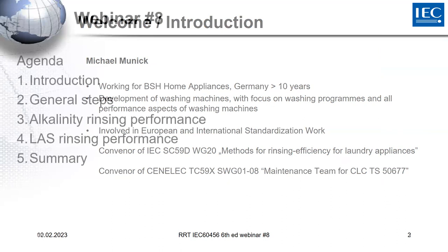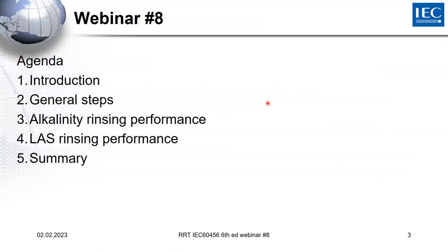So let's go on. Today I have a short agenda, a little bit of introduction. What do we do? What are the general steps that we have to perform besides everything else? I will not go into the details of the normal performance measurement. This has been done in the last webinars. Then we will go to the alkalinity rinsing performance. This is a method most of you know, but there are still some points to consider and there are differences. And I want to point out some important things that might lead to a better repeatability and maybe also reproducibility. The fourth point is the LAS rinsing performance. This is for most of you a very new method, might be the first time that you measure it, or you haven't done it so often. Some labs have done it quite some time. And in the end, there will be a small summary.